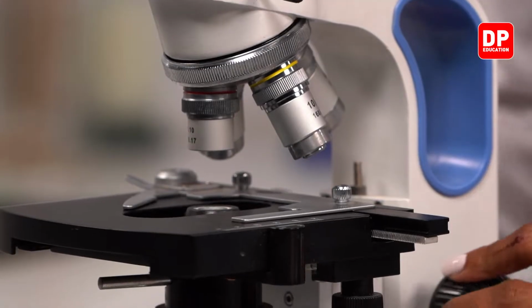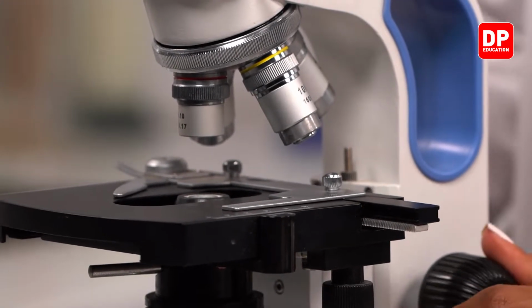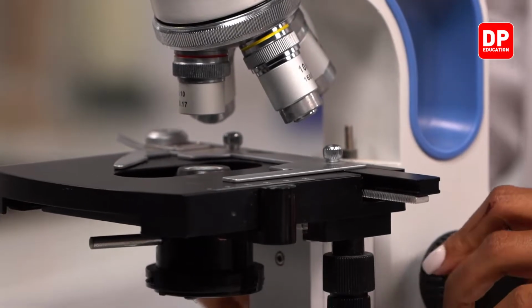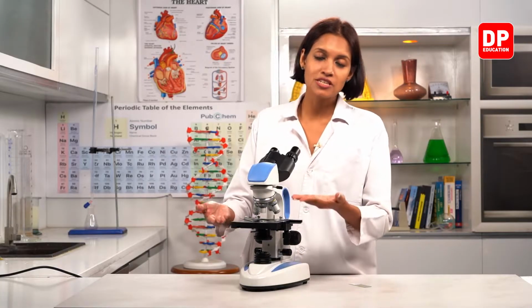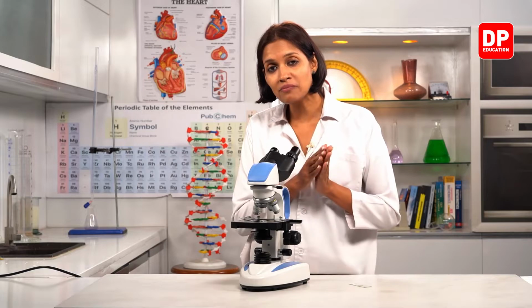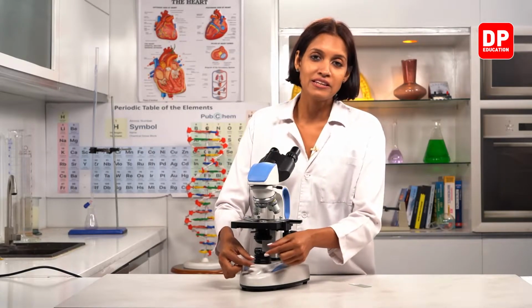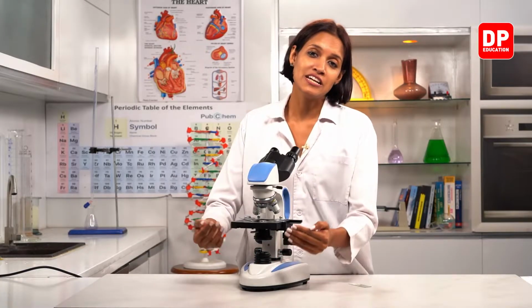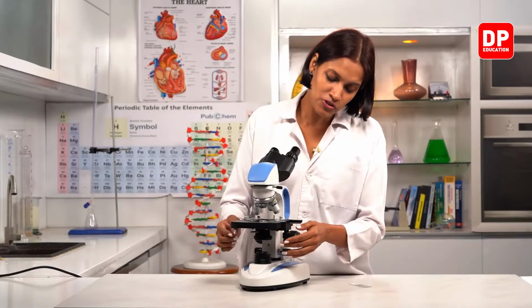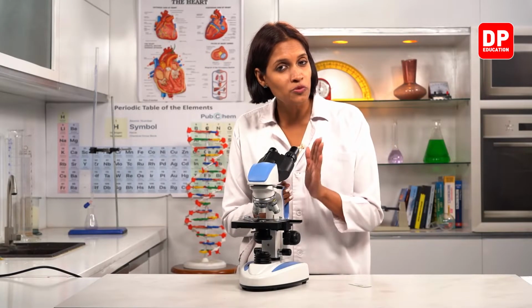So we can move it like this if you want to take it towards the specimen, and otherwise to the other direction. Okay? Right. Then what we have to do? We need to adjust the amount of light coming towards the specimen. Now in a basic microscope, this is done by rotating the mirror, right? Turning the mirror to the specific direction where the light is coming from, and also using the diaphragm. Now in this developed microscope, do we need a mirror?